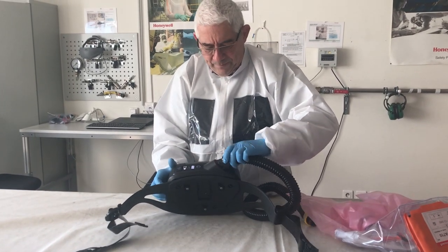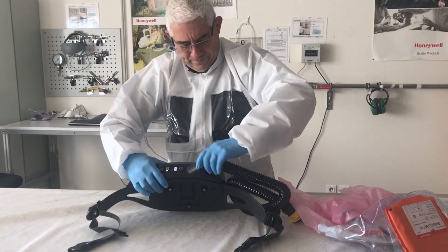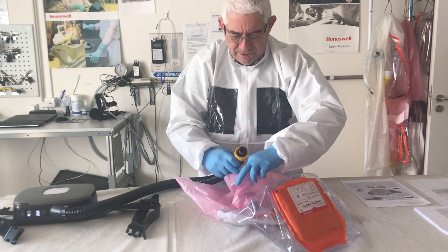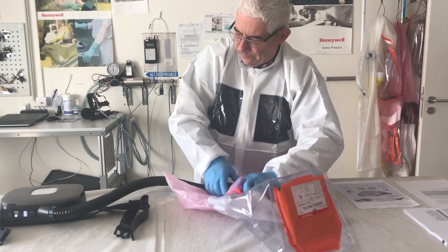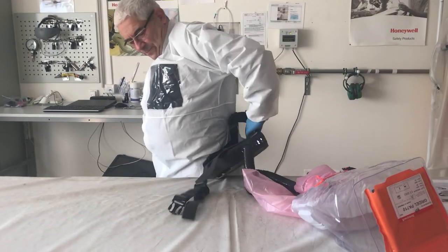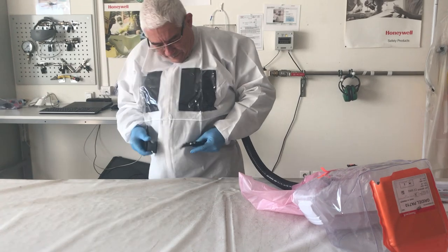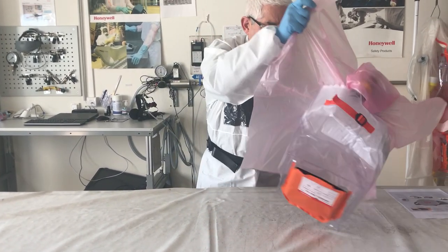You equip the blower with the pipe and fix the pipe at the entrance of the hood, then dress the blower and dress the hood.